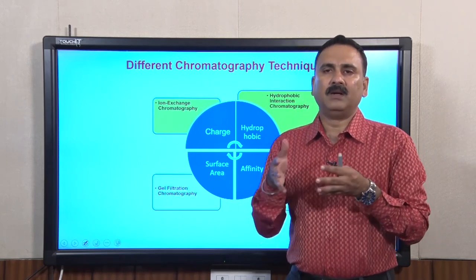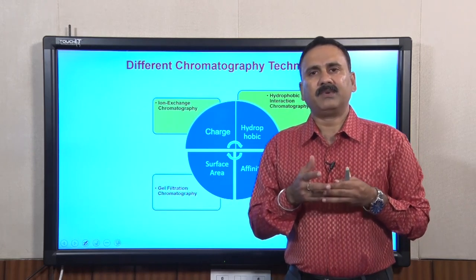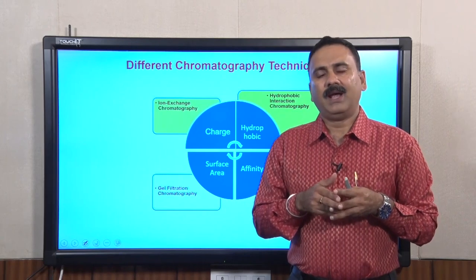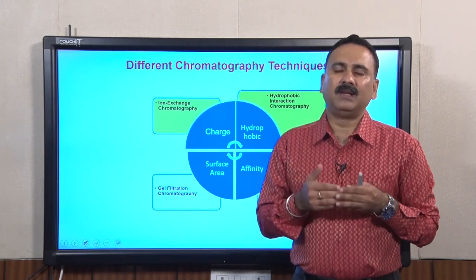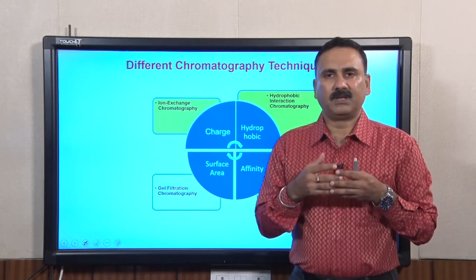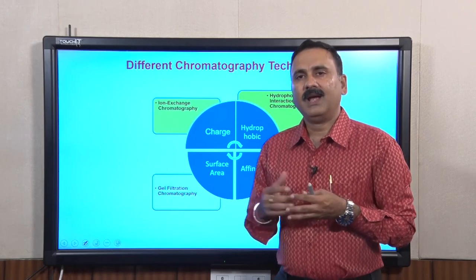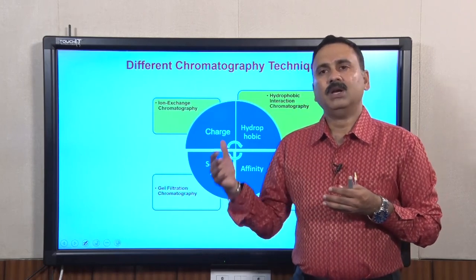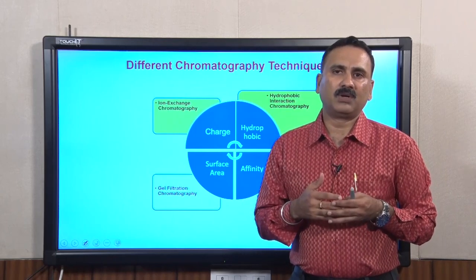In one of the lectures, we discussed how you can exploit the presence of charge on the protein in the technique called ion exchange chromatography. And in the next lecture, we discussed the hydrophobic patches present on the protein surfaces and how that can be exploited to purify the protein using hydrophobic interaction chromatography.